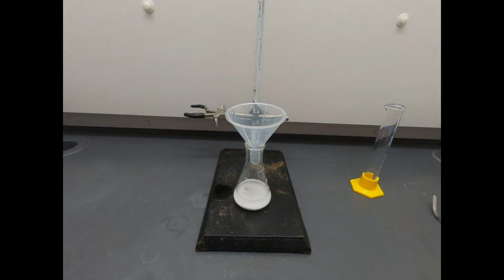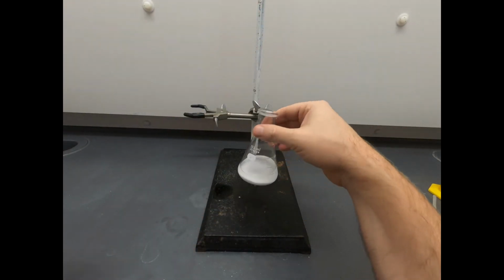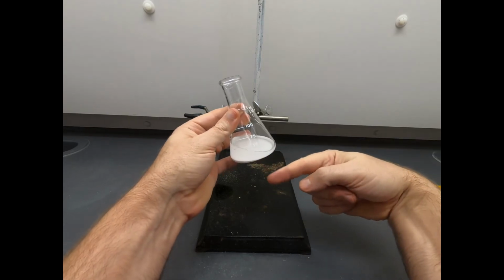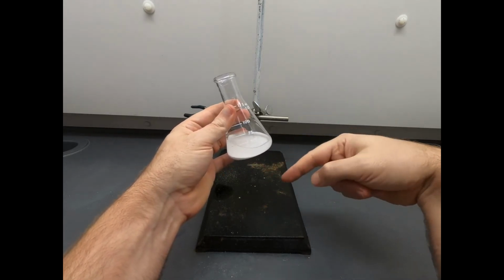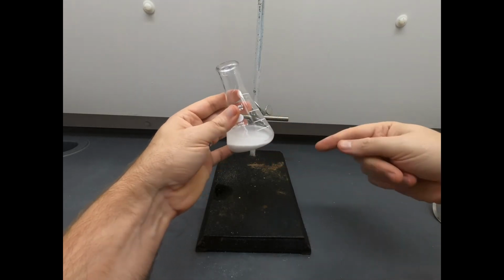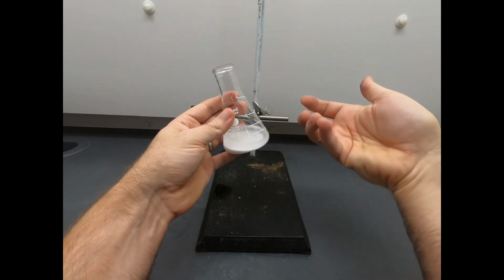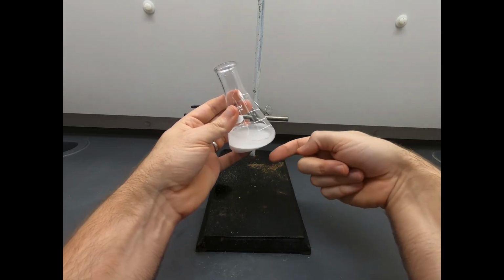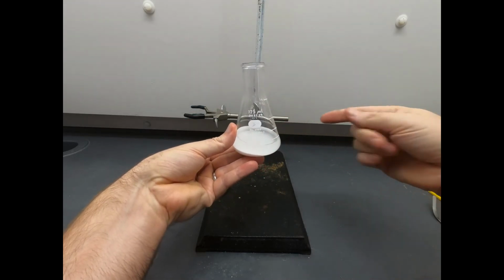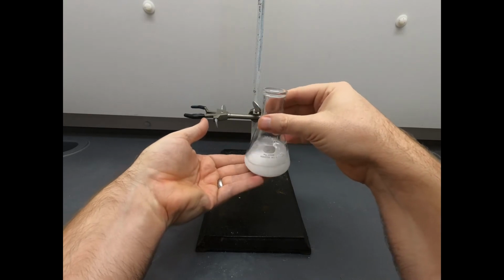Okay, so now we are ready to go ahead and extract this. So we have isopropanol, we have the solids from the pill. Those solids include aspirin, as well as things like the binders that are found in these tablets. So we're going to extract this. Presumably our aspirin is going to go into the isopropanol layer, and some of these solids, these salts and binders, are going to remain as solids. So even though we've done the extraction, we're still going to have solid in the bottom. That doesn't mean it's failed, that just means we've extracted what we want.